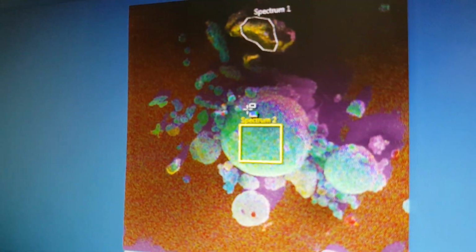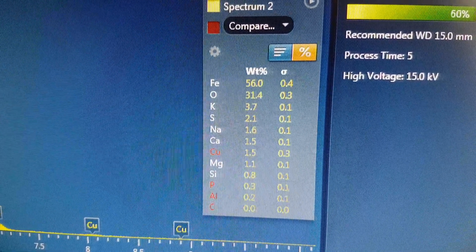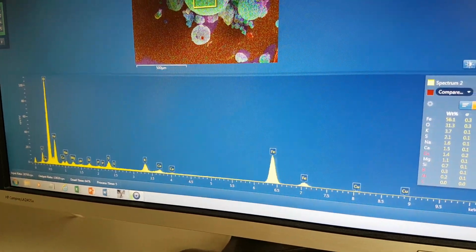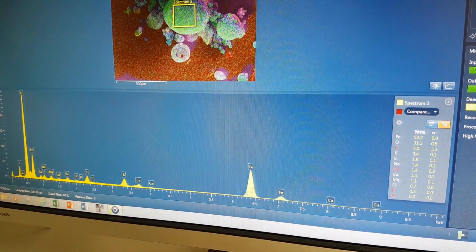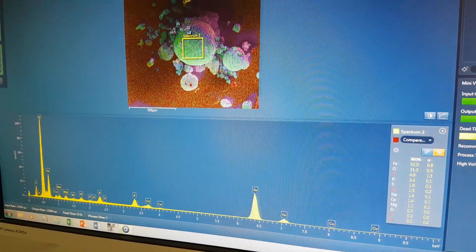So this looks like a more lumpy thing. Spectrum 2, what are we seeing? Well, there we go. It's basically mostly iron. Oh dear. Oh, George, you're not wrong. So this is quite exciting for a 2-minute run in the basic nova reactor.